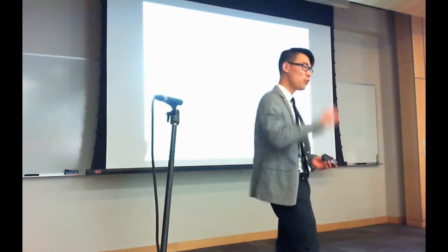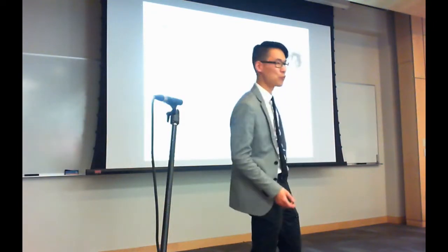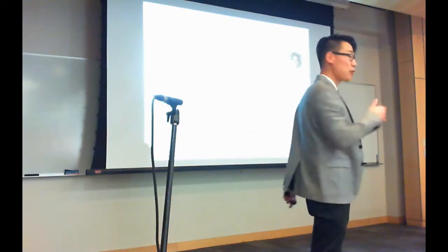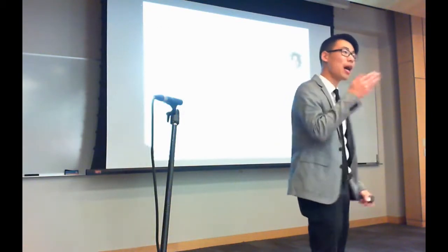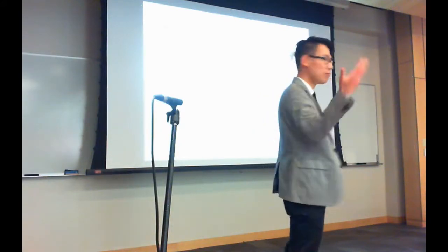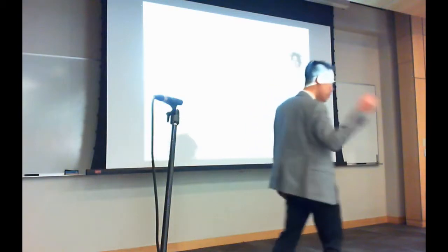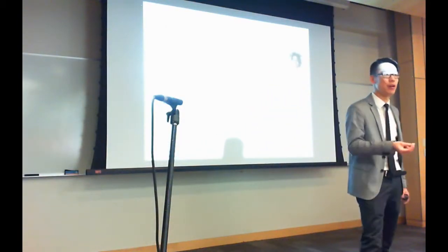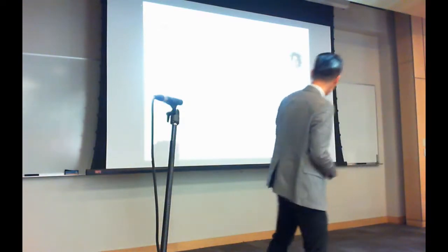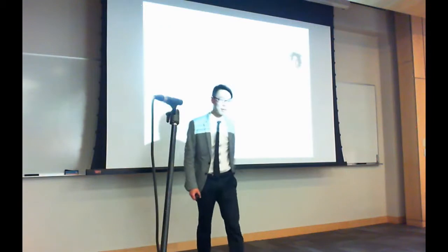Instead, we flip the question. We change the null hypothesis and say, well, we can't find this red distribution, but what if we assume that the query spectrum is actually a replicate, or from the same compound as our library spectrum? We acquire the same compound multiple times and see how it looks compared to the library spectrum. How much variability is there in the mass spectrometer when we acquire the same compound multiple times? And so we can actually calculate this distribution here on the right.